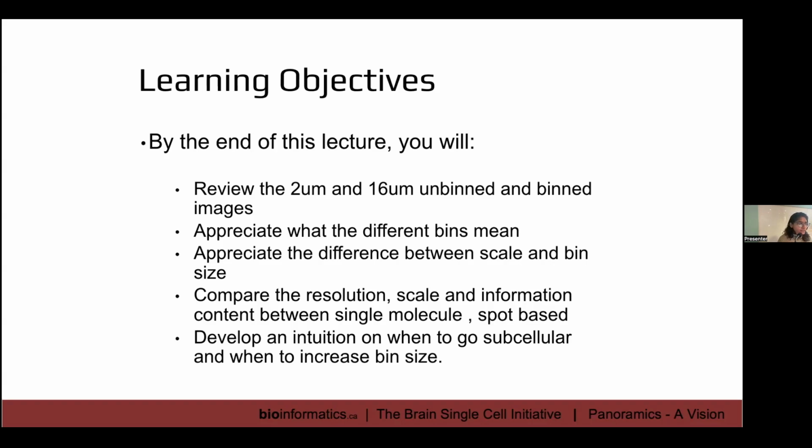All right. There was someone who came just last week and a few weeks ago, and sometimes I just tell them, why do you want to invest in a Visium HD when you can simply just get a similar result or even better results from a Visium? All right. So these are all things that you already have, all the skills of a scientist. Like, we don't have to teach you any of this. But what we want for you to take home from these lectures is to understand the value of these spatial platforms and to make all the right choices.